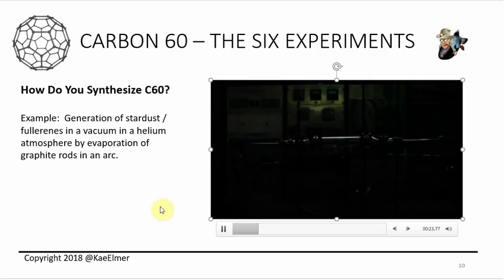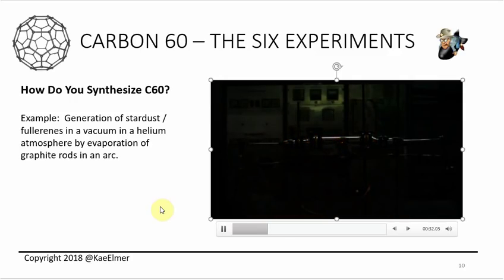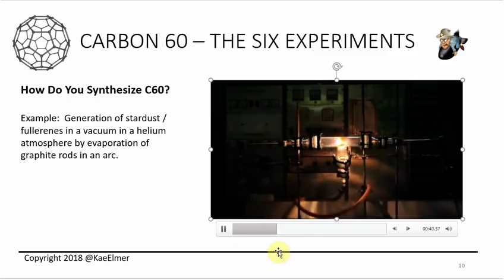Okay, so here you go. This is actually how scientists create, or I'm sorry, extract C60. It's in a tube of helium, and then they create that arc between two graphite rods, as you just saw. And then there you go. So there it goes, and this is the video.